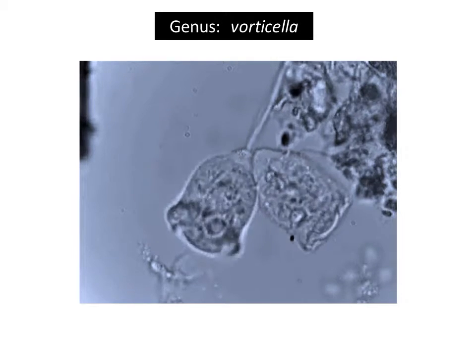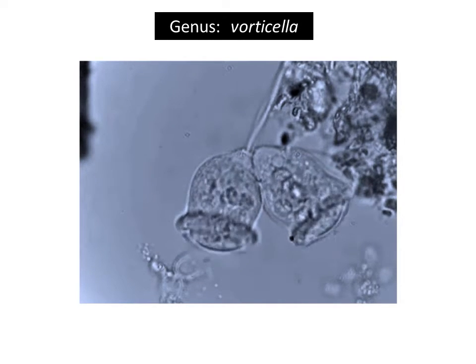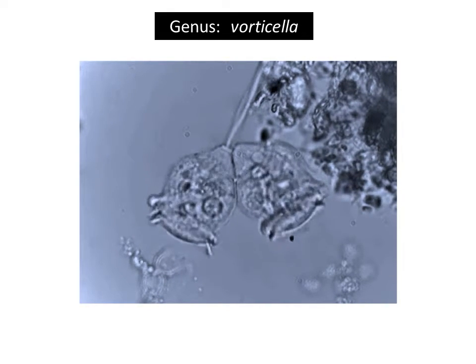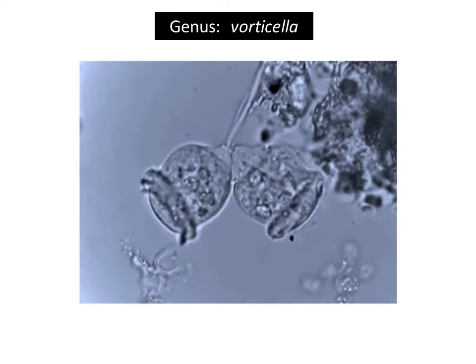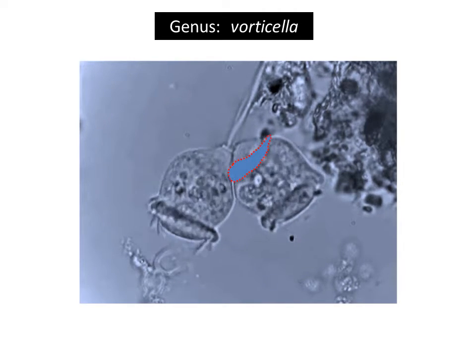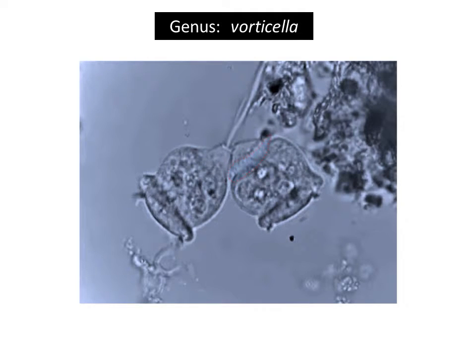The anterior oral region differentiates, developing a circumoral lip surrounding new ciliary membranes. However, there is a new developing differentiating feature in the daughter cell. It is a wreath or ring of coarse cilia near its base.